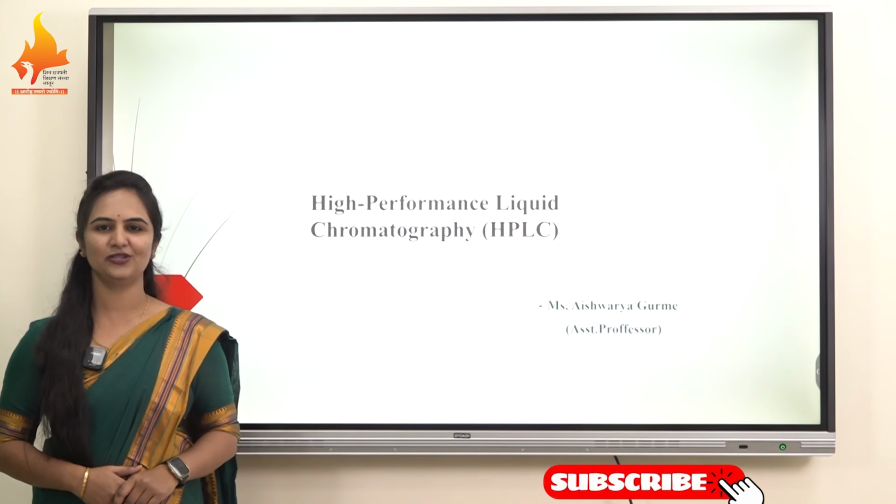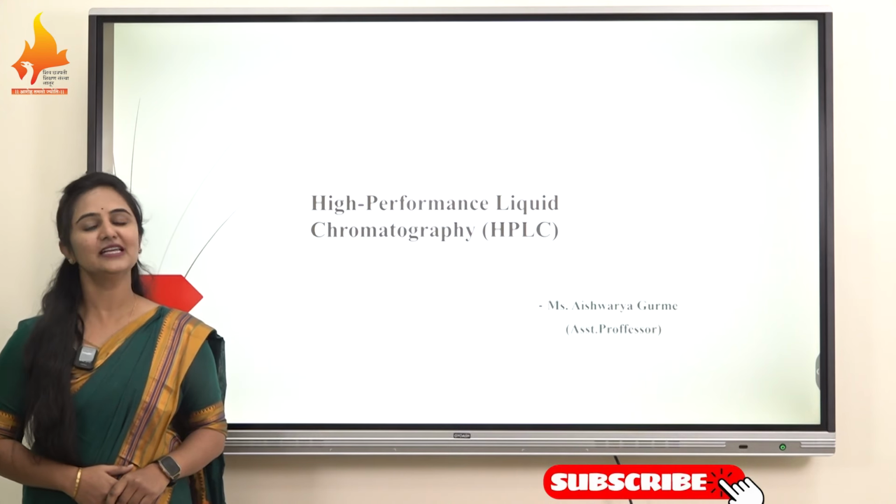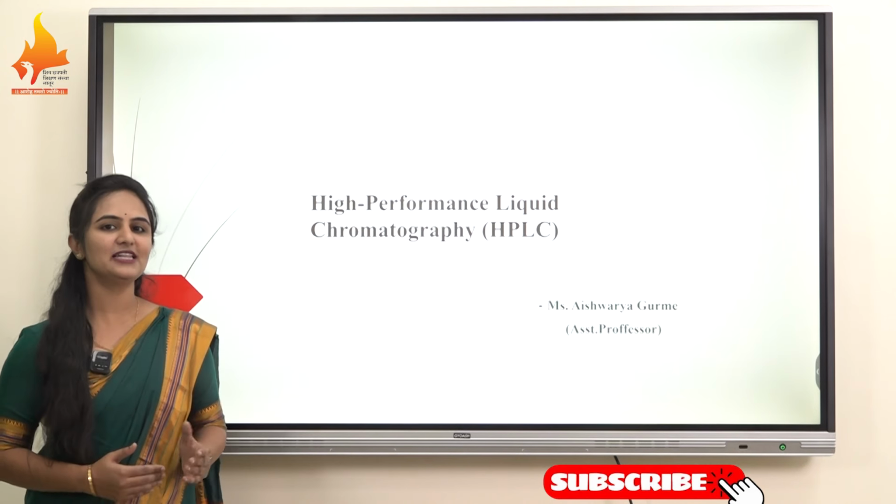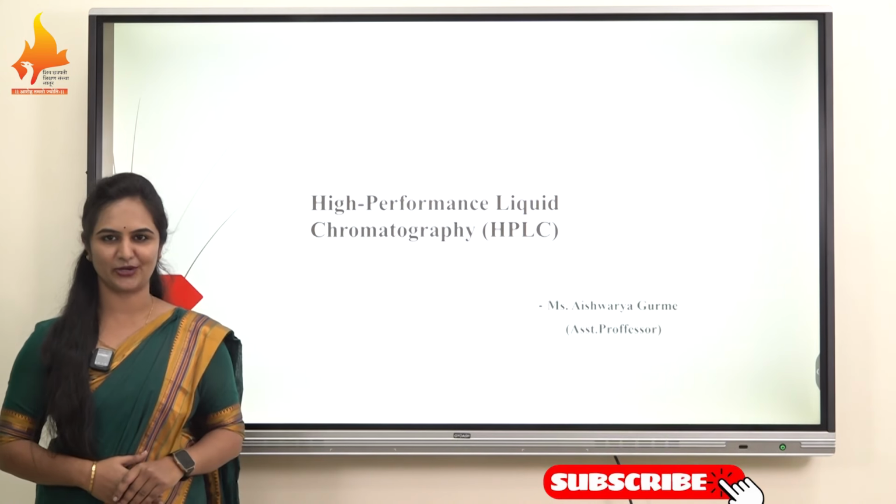Today in this video lecture we are going to study about HPLC. What is meant by HPLC? What is the long form of HPLC? HPLC means high performance liquid chromatography.